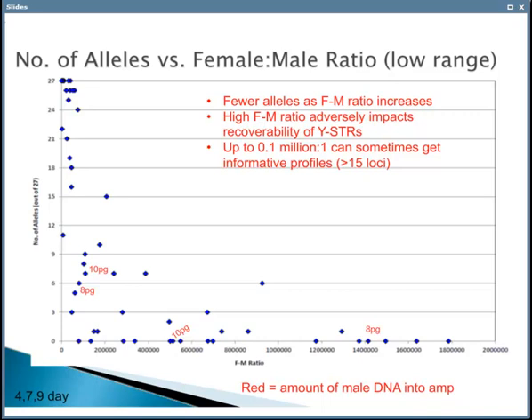But these are extremely large female to male ratios, ones that you would not normally encounter with standard forensic type samples, whatever that means.